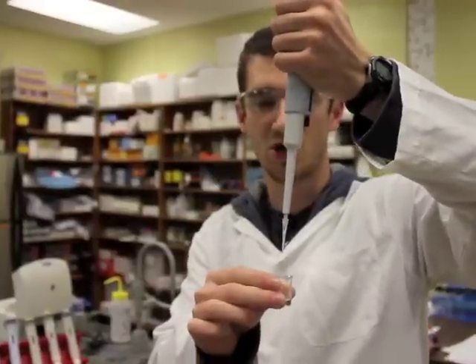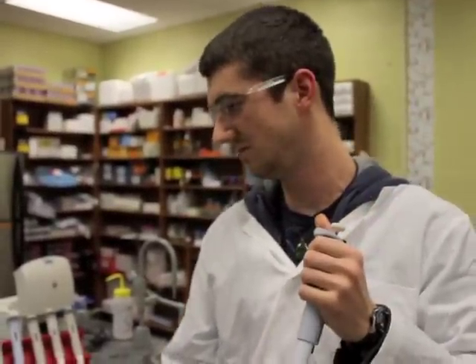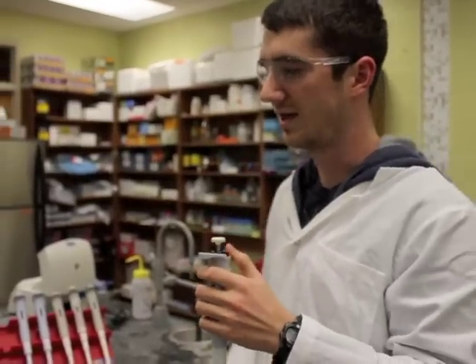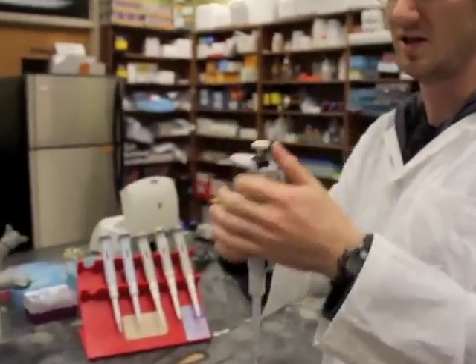Now when you're dispensing the liquid, you push all the way down as much as you can — just like that. Finally, you can get rid of your used tips by pushing down this button here to dispense your tip off.